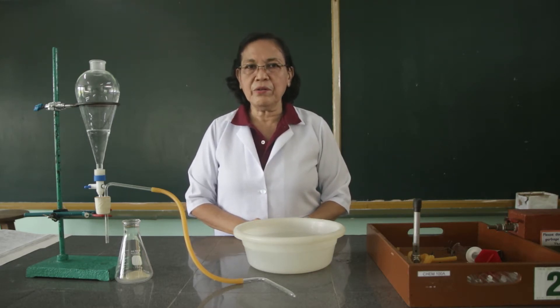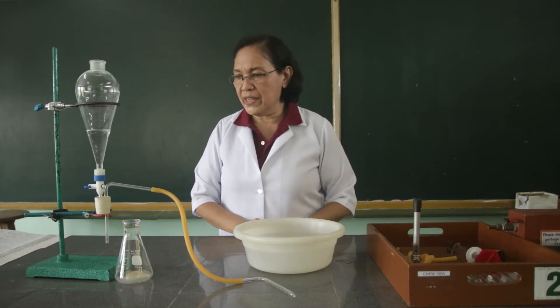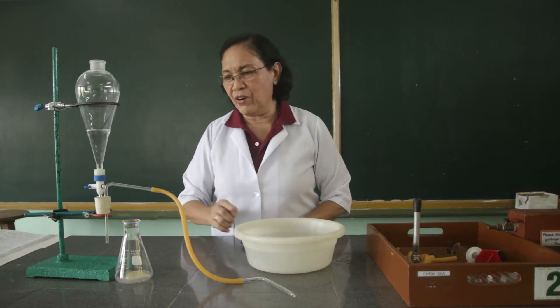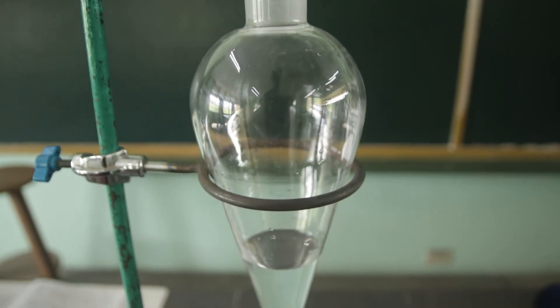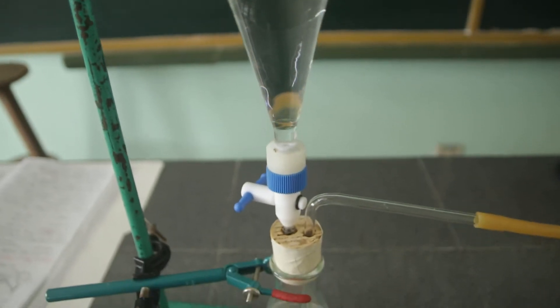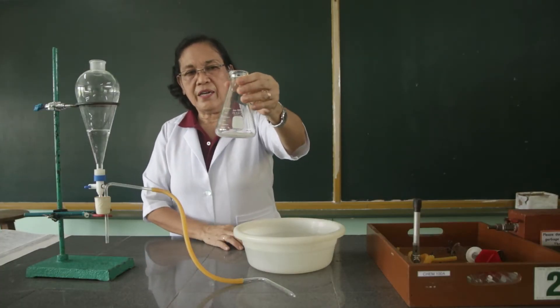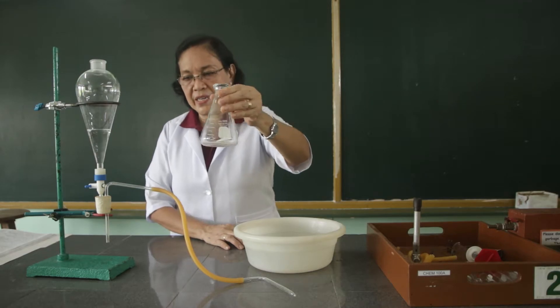Now, we are going to collect the acetylene gas by using this generator. This is what we call the acetylene generator. I have here in the Erlenmeyer flask the calcium carbide.